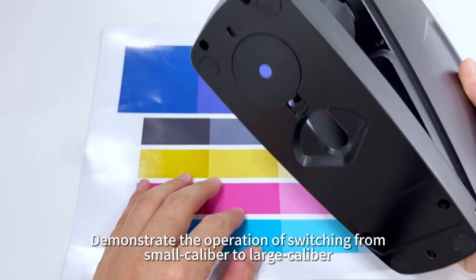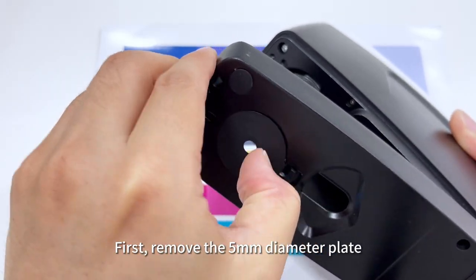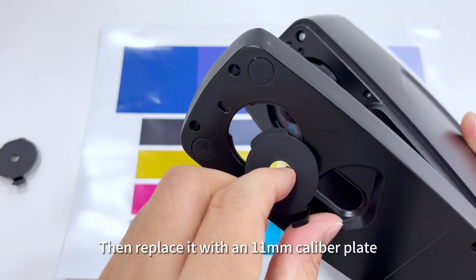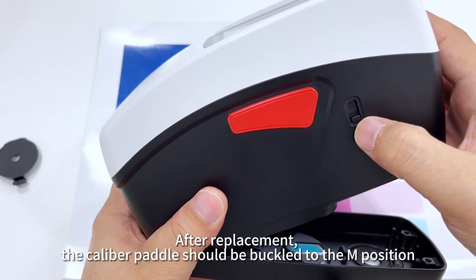How to switch caliber. Demonstrate the operation of switching from small caliber to large caliber. First, remove the 5 mm diameter plate. Then replace it with an 11 mm caliber plate. After replacement, the caliber paddle should be buckled to the M position.